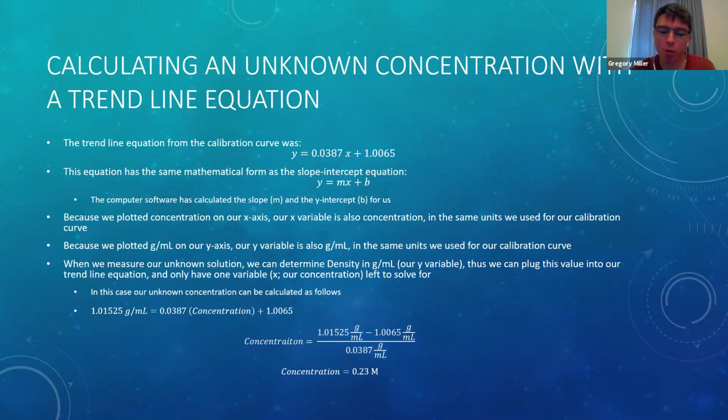If we round 0.00875 to 4 decimal points, we lose that 5. It would be 0.0087, which would round up to 88. But again, we don't want to round since we're doing more math. Use the whole number, but make sure you write down that that 5 is no longer significant. So 0.0087 is what is significant.